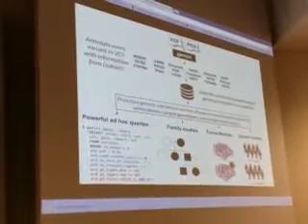So at the end of the day, once you have your file annotated from VEP, you can then plug it into Gemini. And the beauty of Gemini is that you can now annotate extra columns, extra information from all of these various databases here. And if there's a database here that you don't have, or that they don't have built in, they have scripts for you to pull it, for you to create your own. This is an older snapshot of this, but they used to not have ExAC, the Exome Aggregation Consortium, where they had 67,000 exomes. But they now have that in there.